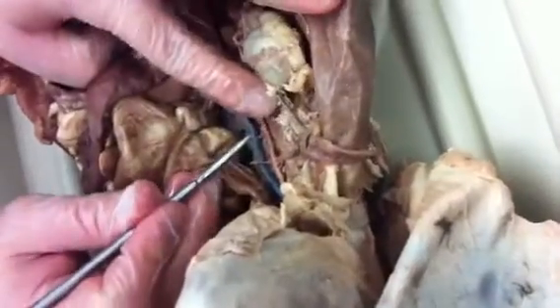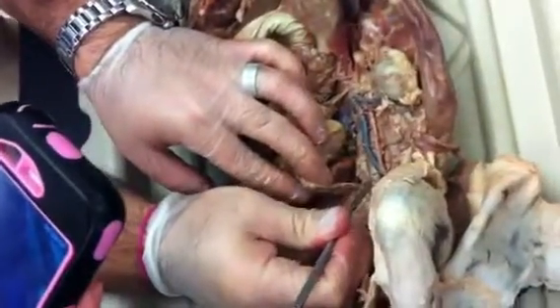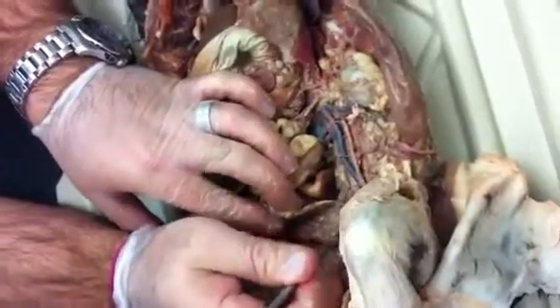Again, abdominal aorta all the way down. We see a branch off the main trunk there of the abdominal aorta. That's inferior mesenteric going to your large intestine. Inferior mesenteric. Same name as the superior mesenteric, just inferior though, it's lower.